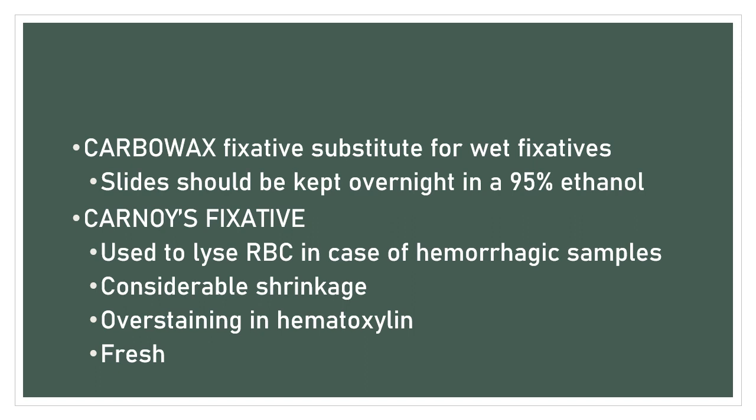So you place that slide, that smear, in 95% ethanol overnight, no? To remove the coating of fixative.